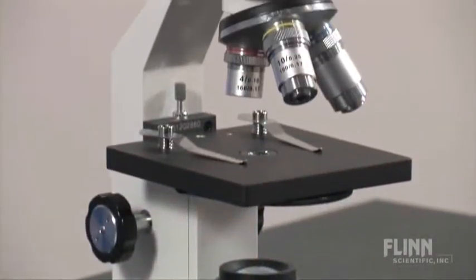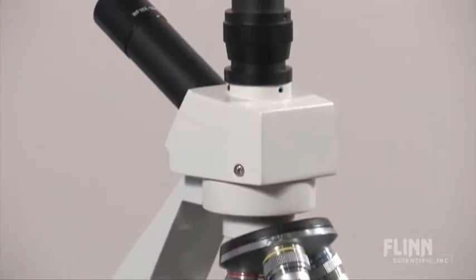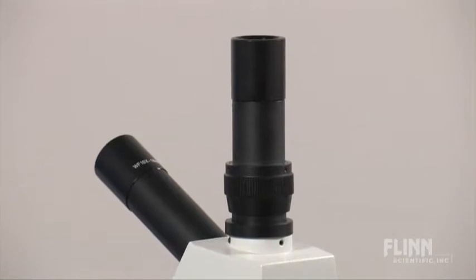The Flynn Economy High School Microscope is designed with long-term value in mind. It has a rugged and solid metal body that will hold up to years of routine student use.